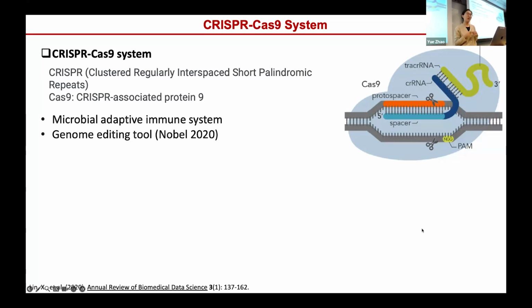That's a double-stranded cut. And then the subsequent DNA repair via non-homologous end joining often introduces small insertions and deletions that can induce a coding frame shift or a premature stop codon. Those artificial genomic variations eventually lead to non-functional protein or degraded messenger RNA, and therefore a functional knockout.